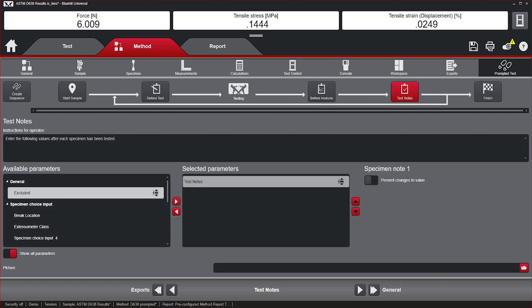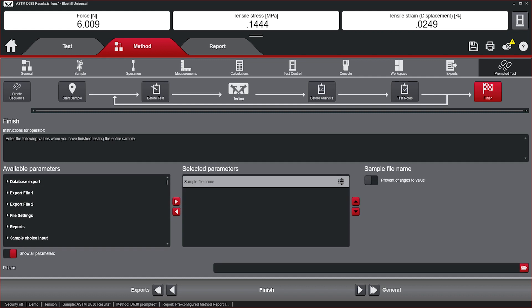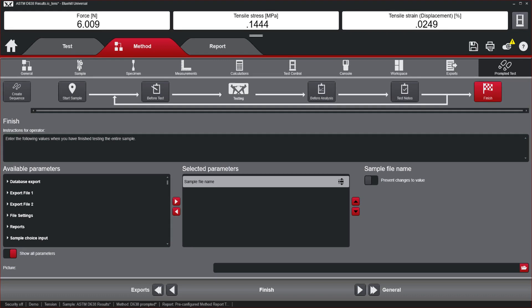Test Notes – is where the operator could add any additional notes about the test. The Finish prompt automatically appears when the required number of specimens are tested. It will prompt the user to add any additional information about the sample or alter export settings, such as folder location and file name.